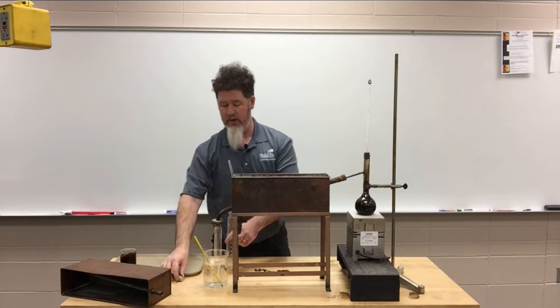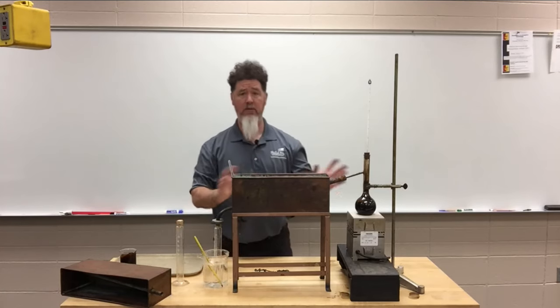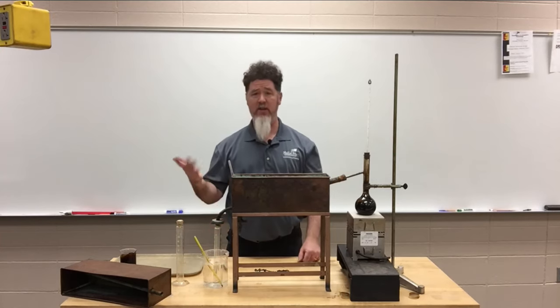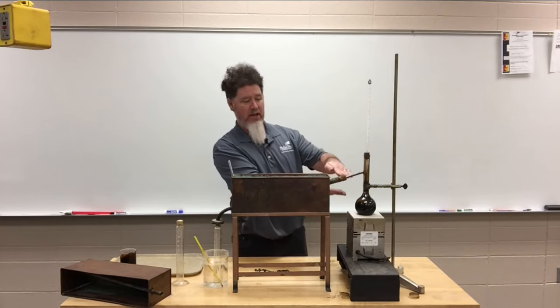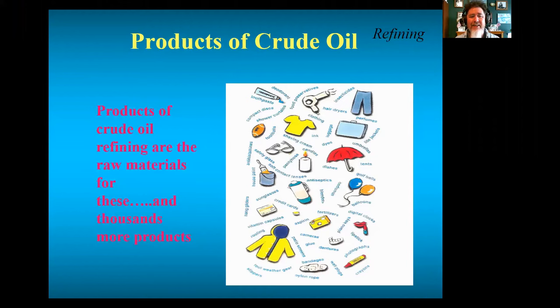And so it's a fun project for the students. It's fairly easy to do. You do need a little bit of equipment to get it started, but once you got it set up, it's fun to see the students' reaction as far as how much gasoline do they think we can make out of this versus diesel fuel.